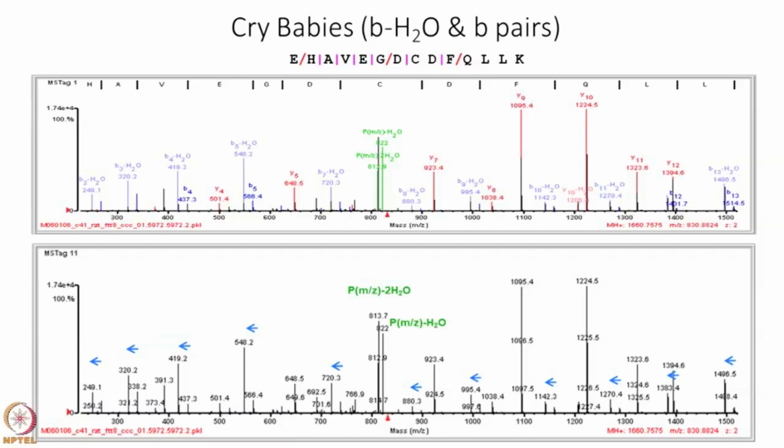Yes. So it's just like we are taking two peaks, finding the distance, and if it matches with some amino acid, we assign it. But there are instances, even when you are working right now, where you had a doubt in your mind whether you are mapping it wrongly. How do we know that we are on the right path? Okay. The way that I've said, after I've told you this is all the information, and then I tell you magically this is the answer, your good question would be, how do I know it's the answer? Well, the spectrum all by itself has no more information really than we were able to determine.